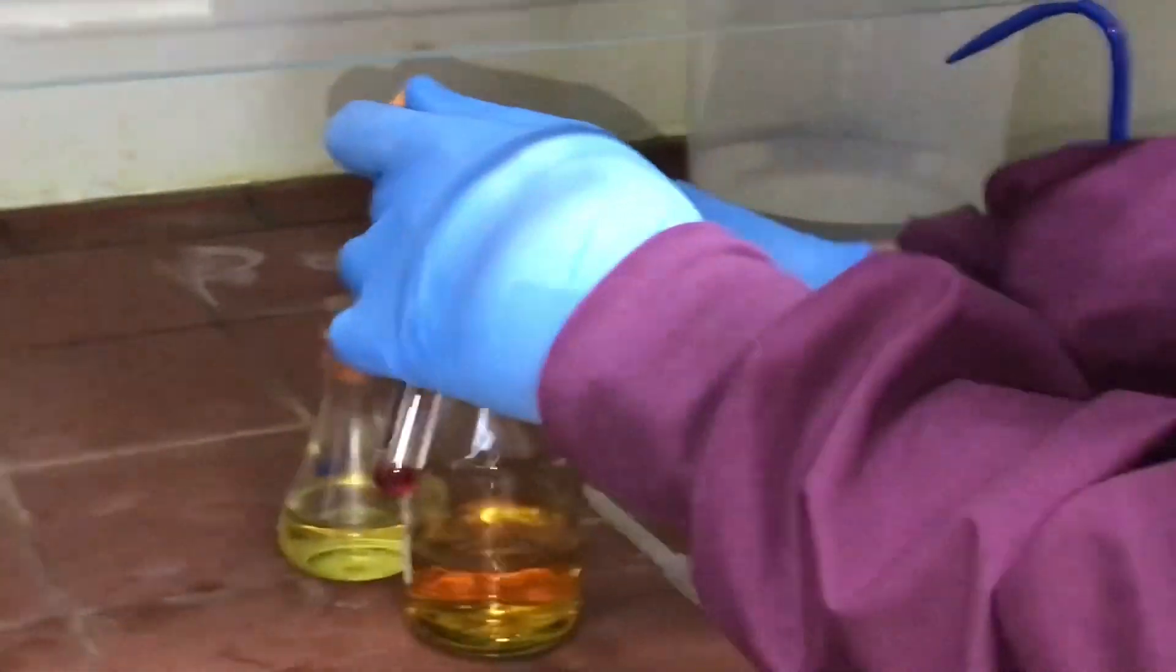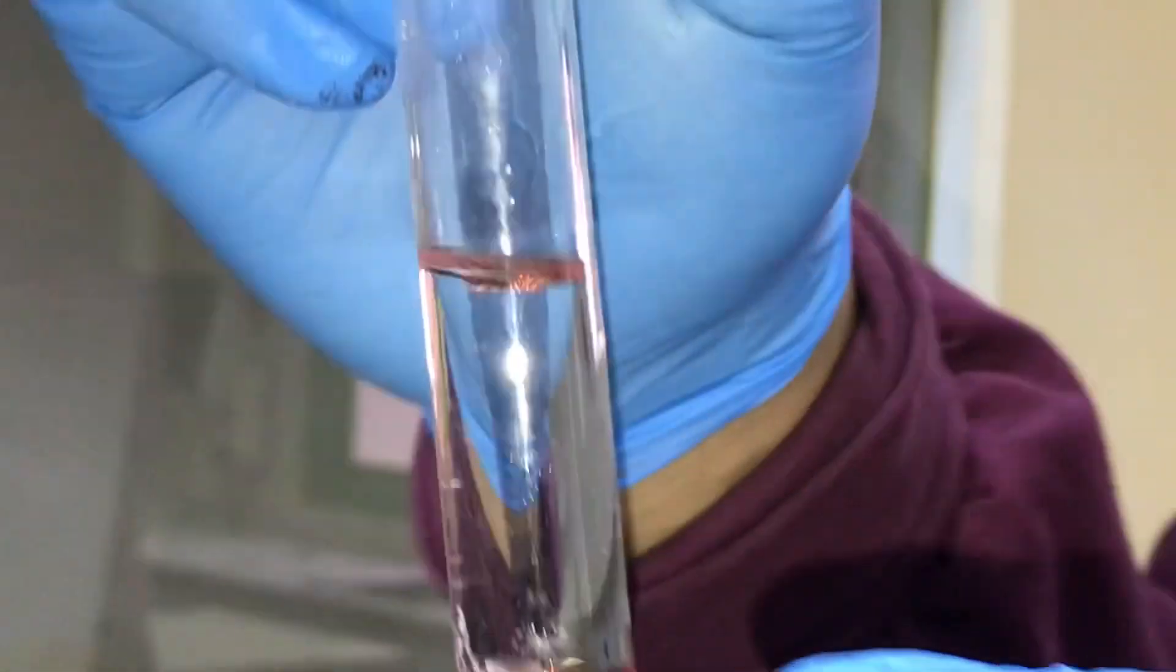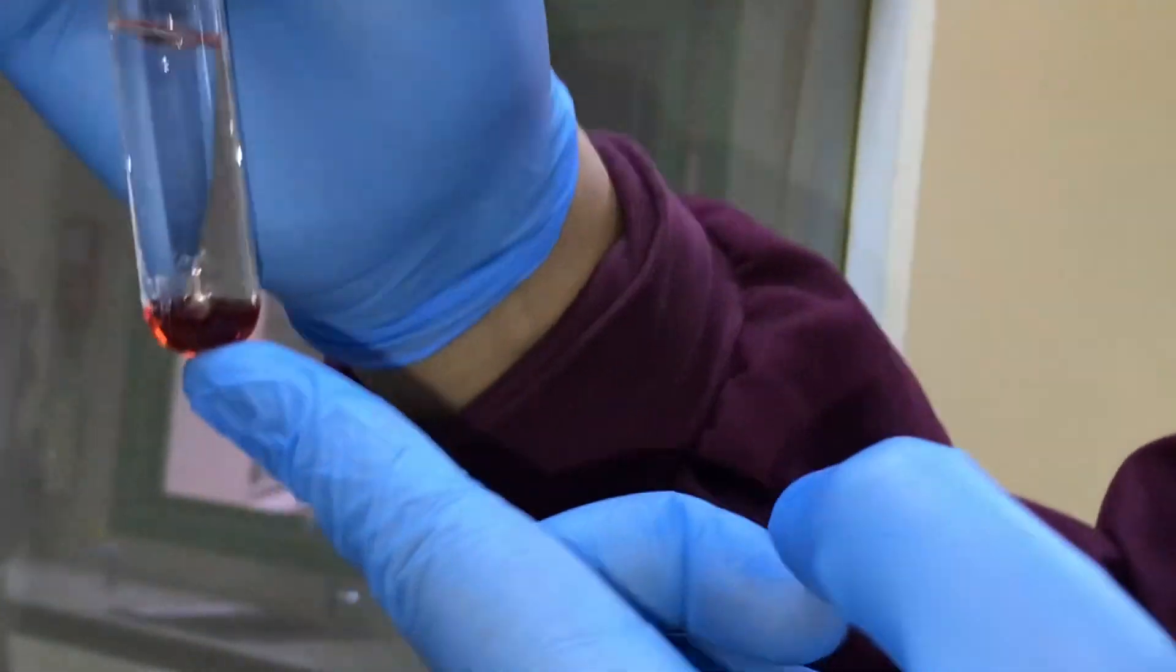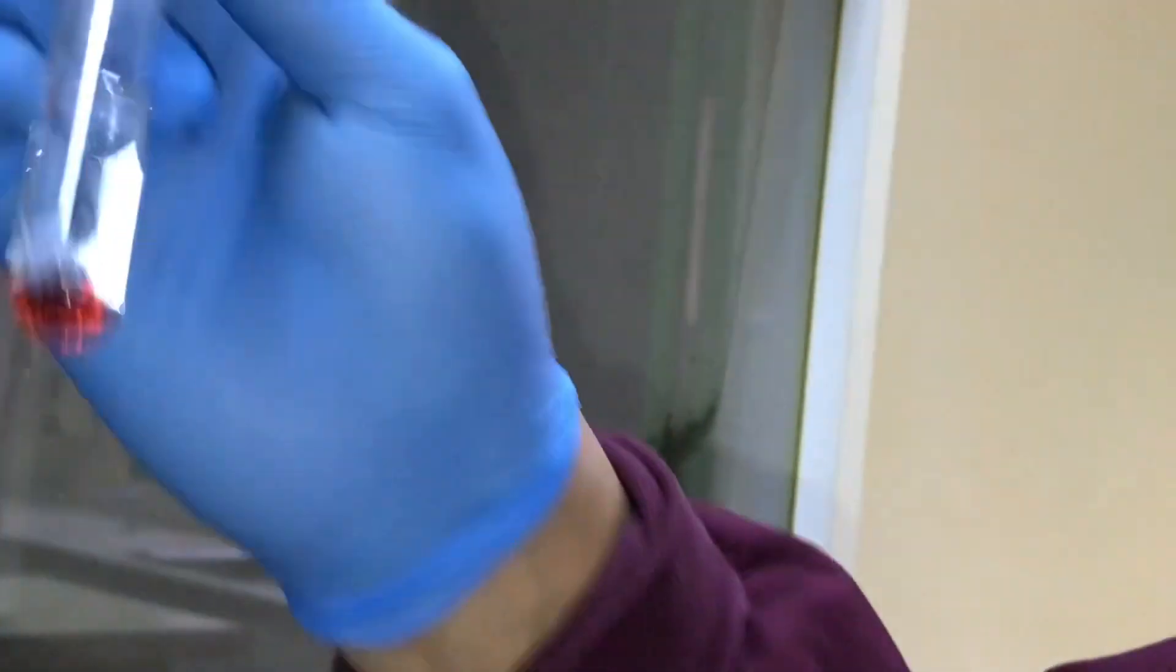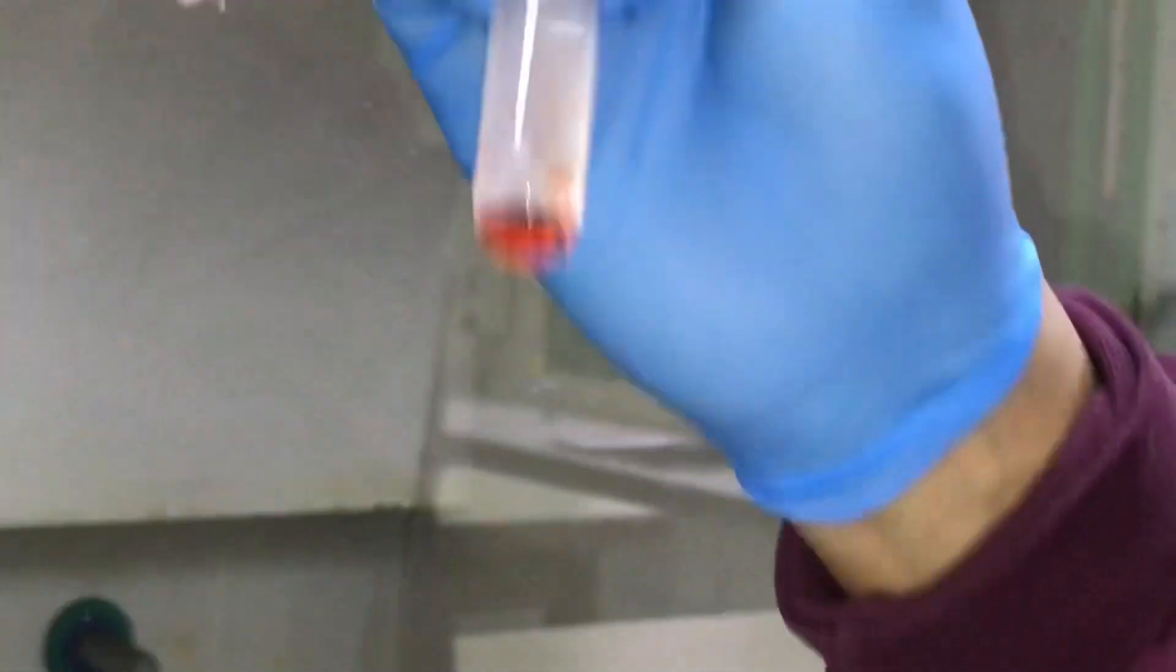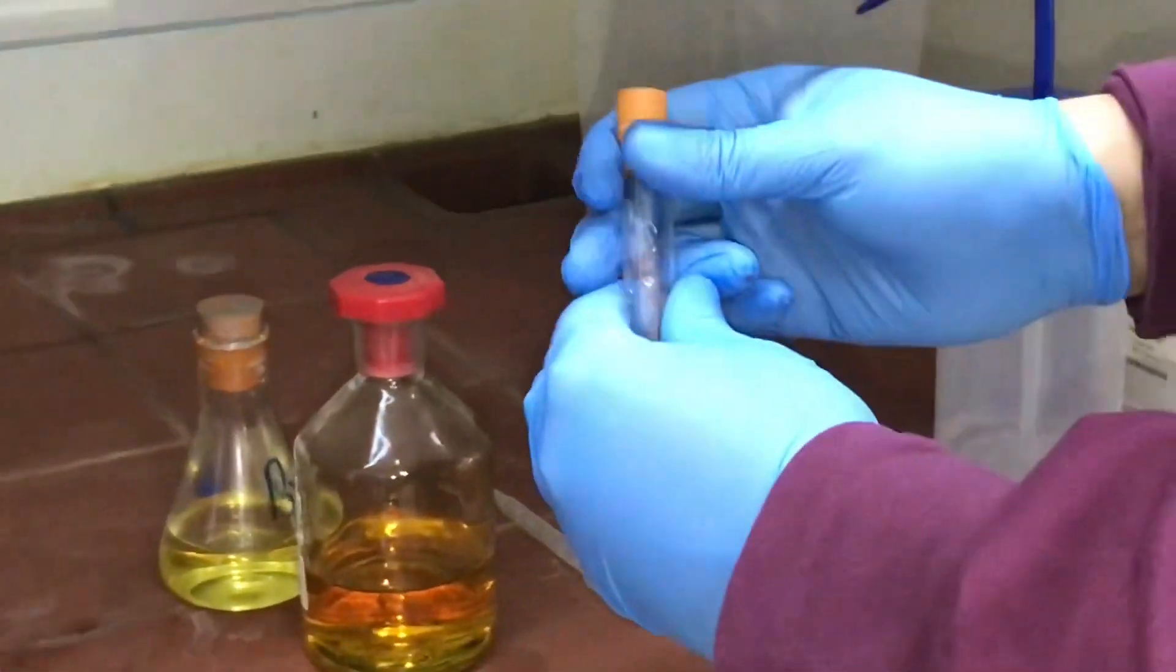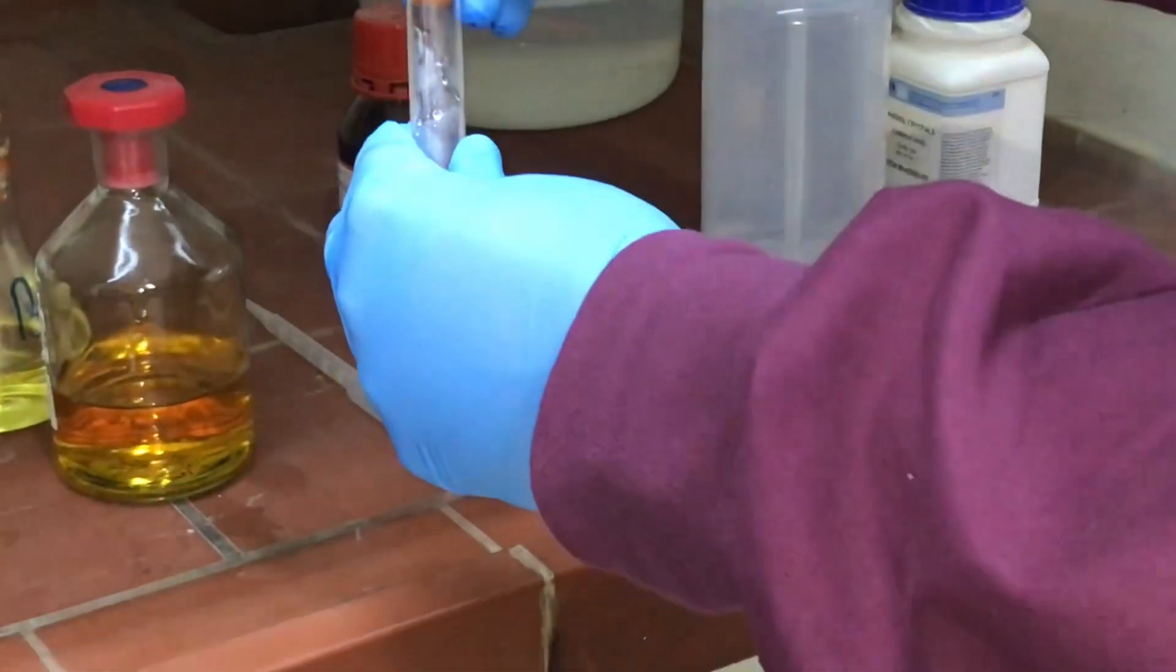You can see the top layer is definitely the bromine—there's more of that layer than the phenol at the bottom. What I'm going to do now is give it a little shake to try and mix it up to give a chance for the phenol to react.